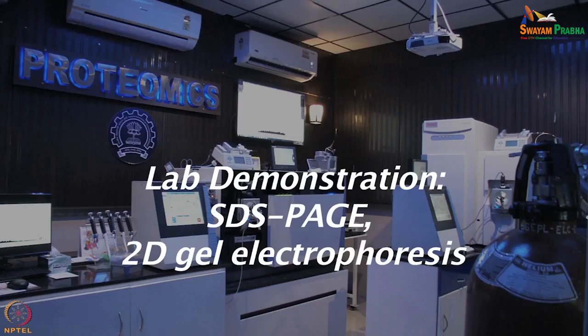Let's start a laboratory demonstration session where my TAs will show you the various steps involved in performing 2D electrophoresis, starting from rehydration, then doing isoelectric focusing, equilibration steps, and performing the second dimension separation. So let us start the SDS-PAGE lab demonstration session now.